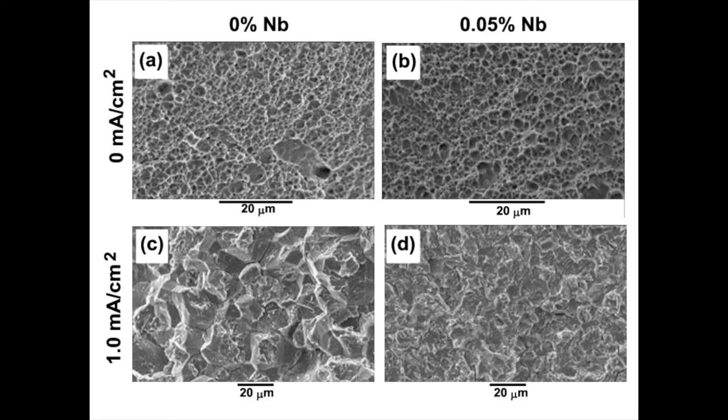You can see where it almost comes to a perfect three-point edge. I know I'm not making sense because I can't show you my cursor, but basically you can see how some of the lines come in and they make almost perfect thirds, as if there was a circle there and you're dividing it into perfect thirds. And then D is a transgranular quasi-cleavage fracture. There may be some cleavage in this fracture that we're going to see.